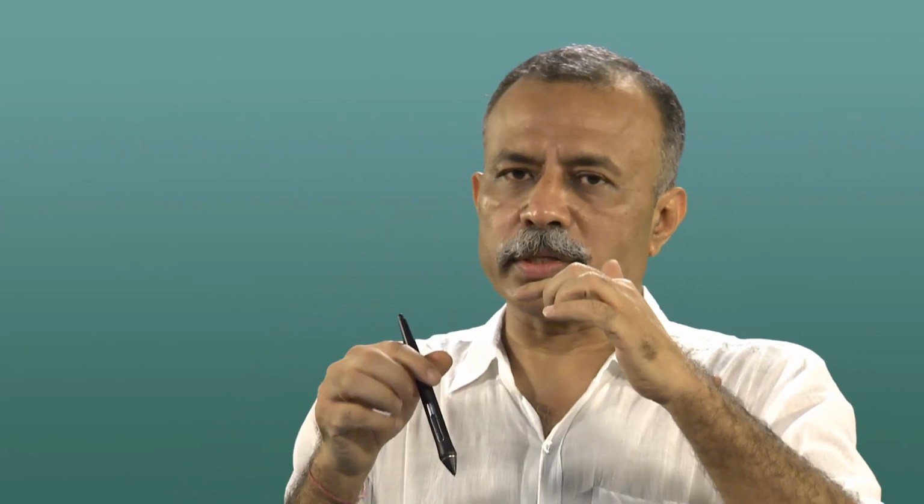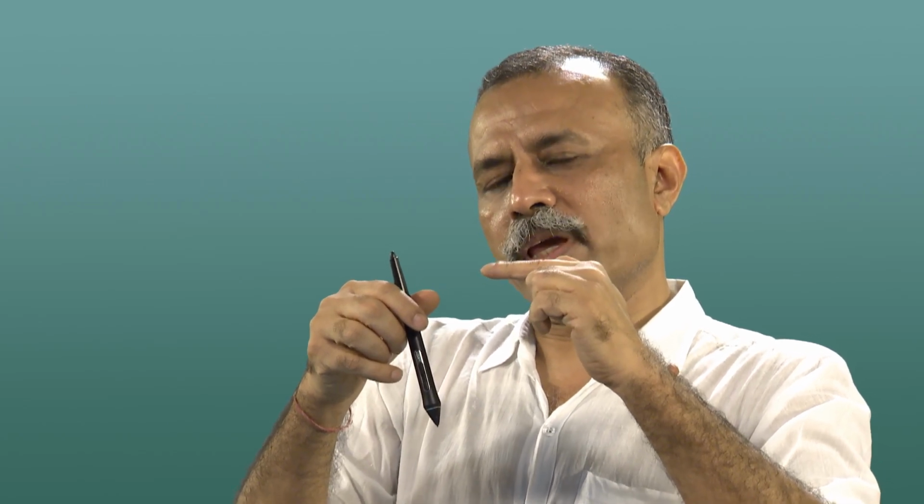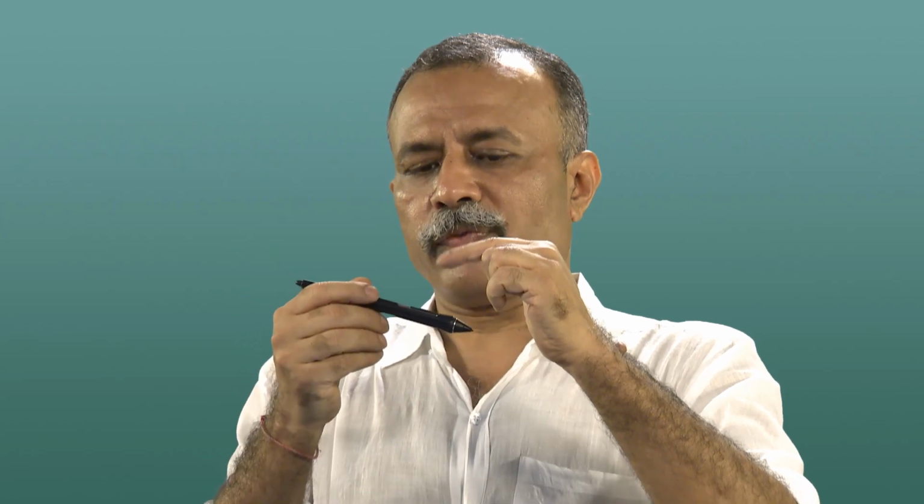Or you can do it the other way. In order to remove that, what you can do is generate or create a tapping in the tip itself, and you know the tapping frequency. You know that it is tapping at a known frequency. Now, if you hit the surface, if there is a change in the tapping frequency, that means the surface has a very characteristic feature, right? And similarly, if it is a harder surface, then it will have a different kind of tapping frequency versus if it is a softer surface. Depending on the nature of the surface, the tapping is going to change.